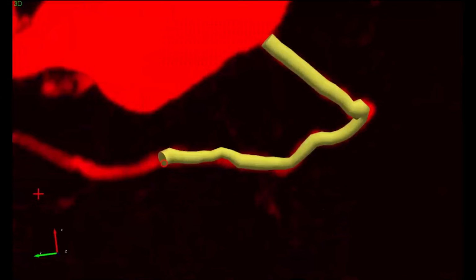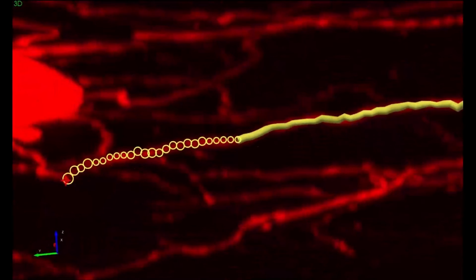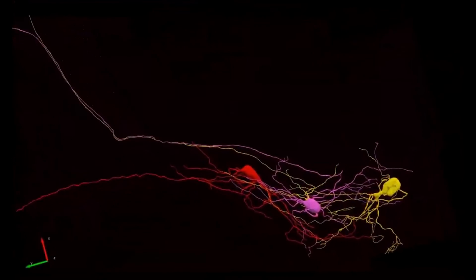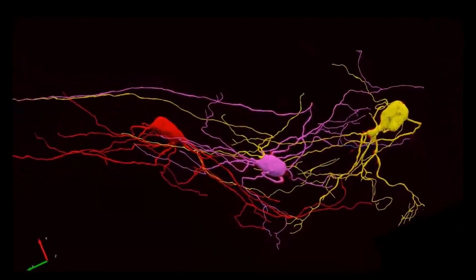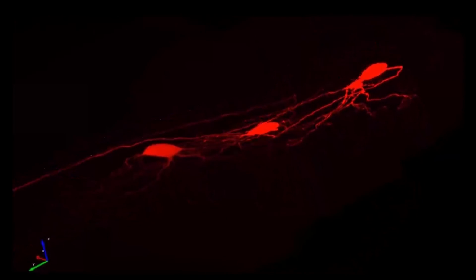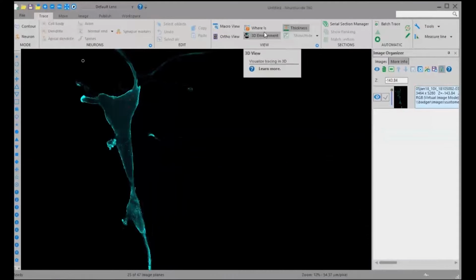Electrophysiological recordings were obtained from these same cells. You can see that the neuronal pathways at the 40x magnification can be easily distinguished and traced. The cell bodies and neuronal fibers were segmented using Neurolucida 360's semi-automatic tracing mode. You can see the complete high-resolution tracing in the video.